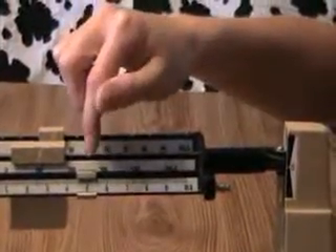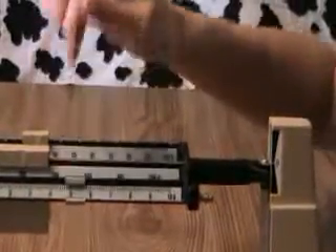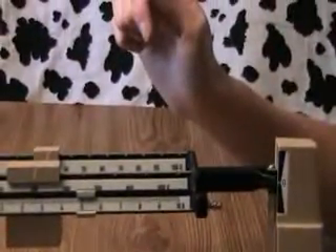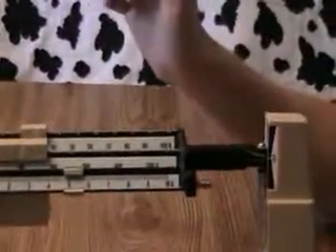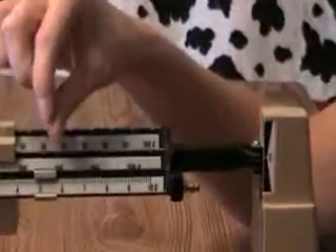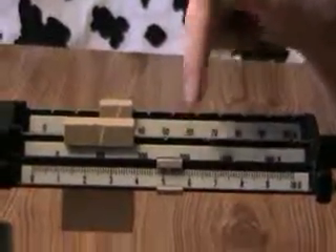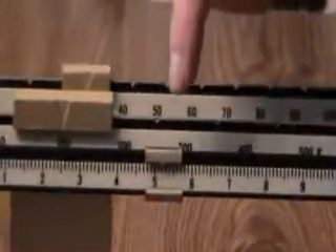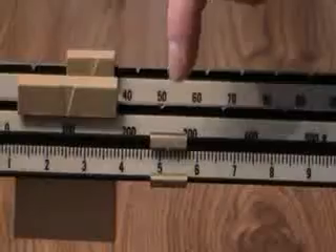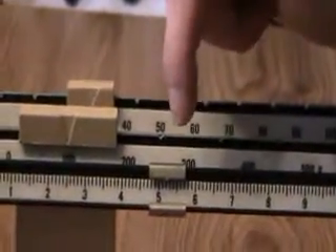Almost there, but not quite — a little too light. All right, pretty good. So I have one hundred plus thirty plus five, so that's one thirty-five. But it's not exactly on five. So just like the ruler, the smaller dashes mean milli — in this case, it's milligram. So I have one thirty-five point one or two.